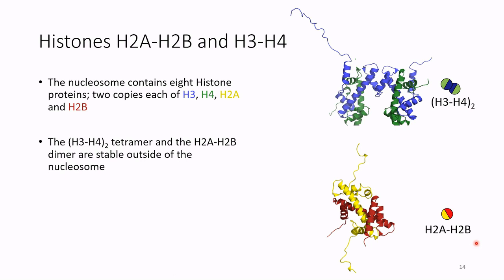We learned previously that Nap proteins are constitutive homodimers and like to oligomerize in a salt-dependent manner. Now, we are going to study the oligomerization of Nap1 histone complexes using SEC-MALS and try to determine the stoichiometry of these complexes.